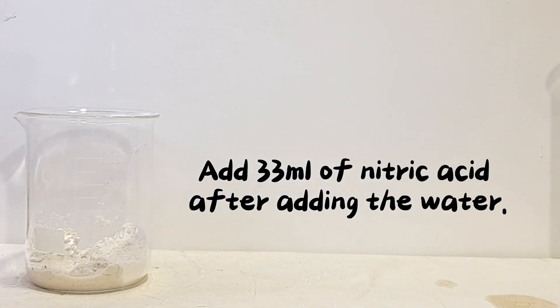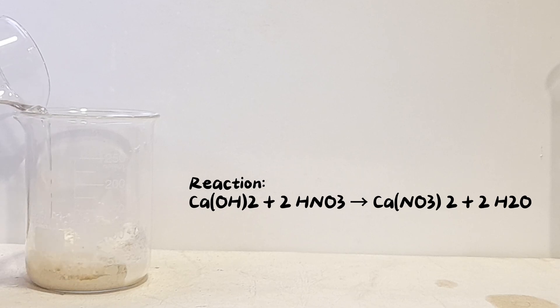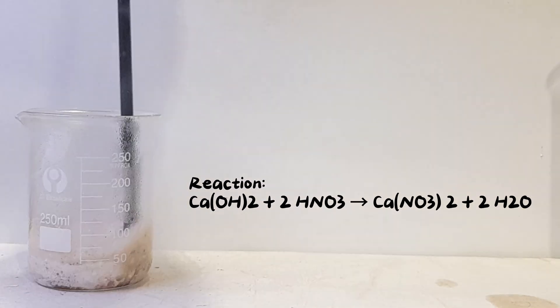Add 33 milliliters of nitric acid after adding the water. In this reaction, calcium hydroxide reacts with nitric acid to form calcium nitrate and water.